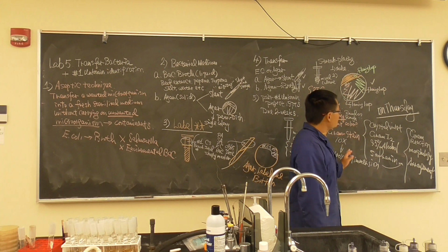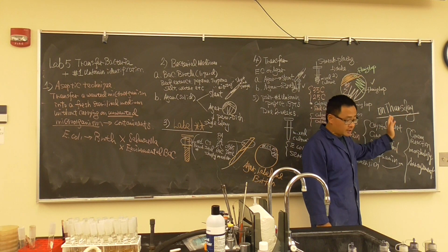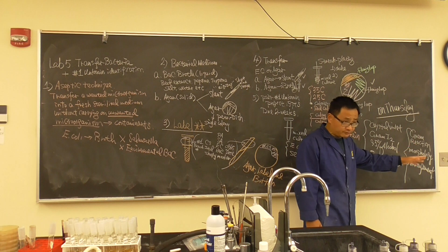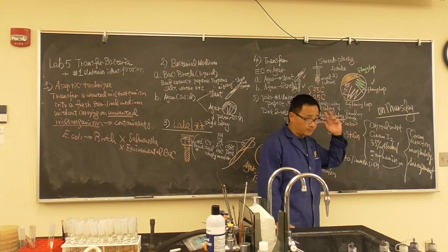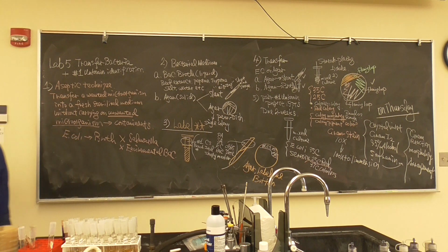So that gives you some flexibility, okay? Basically, try your best to finish it on Thursday. If not, then next week, Tuesday, don't throw away your plate. You can redo it. And if you're missing some of the lab and want to make it up by yourself, the lab will be open for gram stain, simple stain, and endospore stain. It's all there. Okay? Now, next, same as before, I want to show you how to do the bacterial transfer.